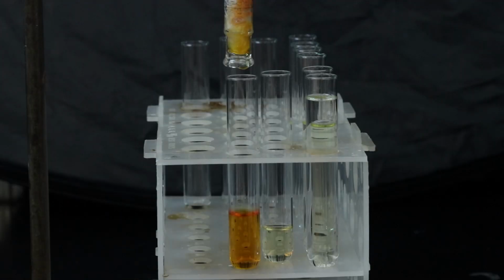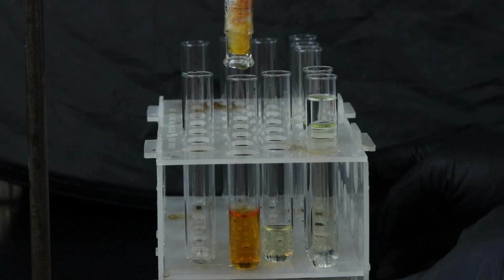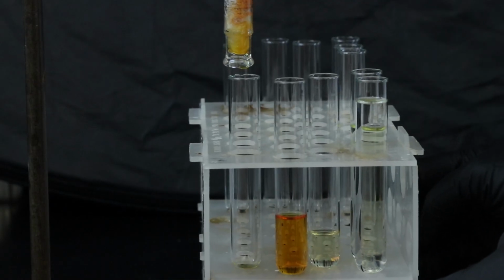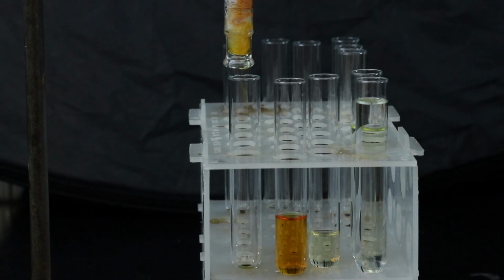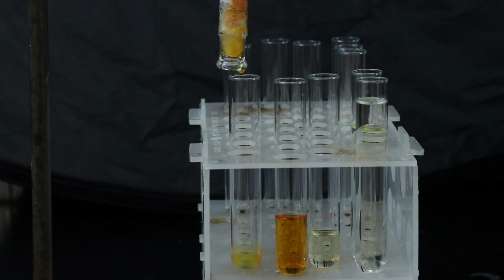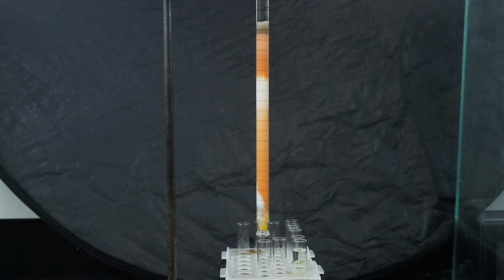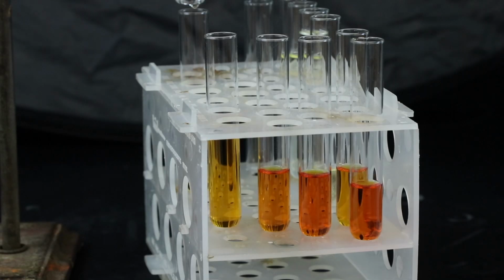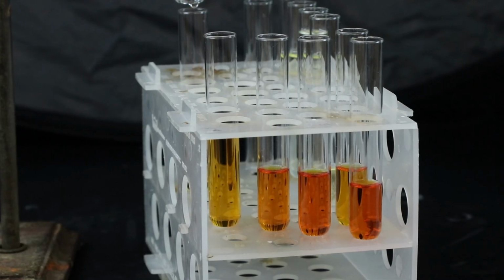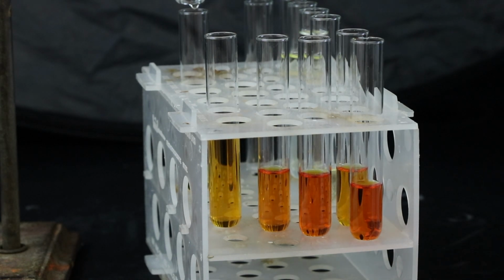Now, I'll actually be separating the monoproduct into multiple aliquots, or multiple test tubes, with just a few milliliters each. And that's just in case there is contamination that comes out with the monoproduct. It's more likely to be only placed into one test tube with a small amount of product rather than contaminating the entire monoproduct that comes out. Now, in this lab, that's probably not super pertinent or necessary since the products are both colored and because there's a clear separation between the two products in the column, but this technique will be more useful in a future lab when it's more difficult to distinguish when there is a switch between one product to the next coming out of the column, and it will help us minimize contamination.